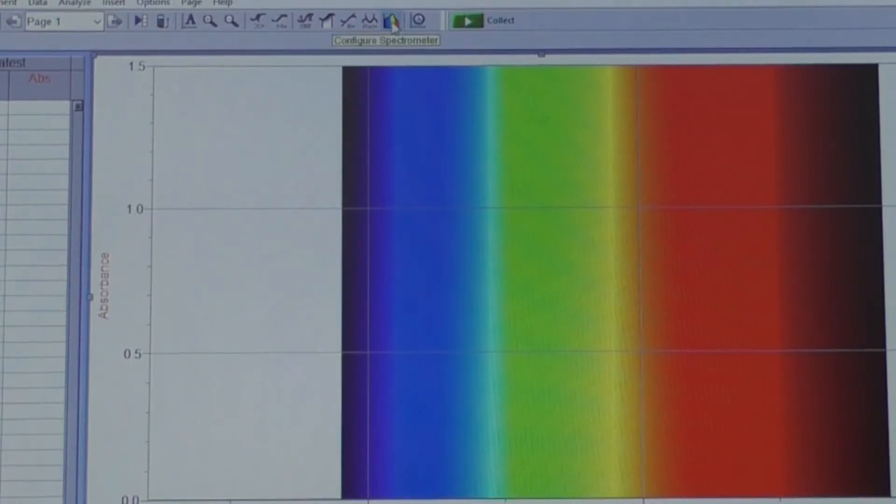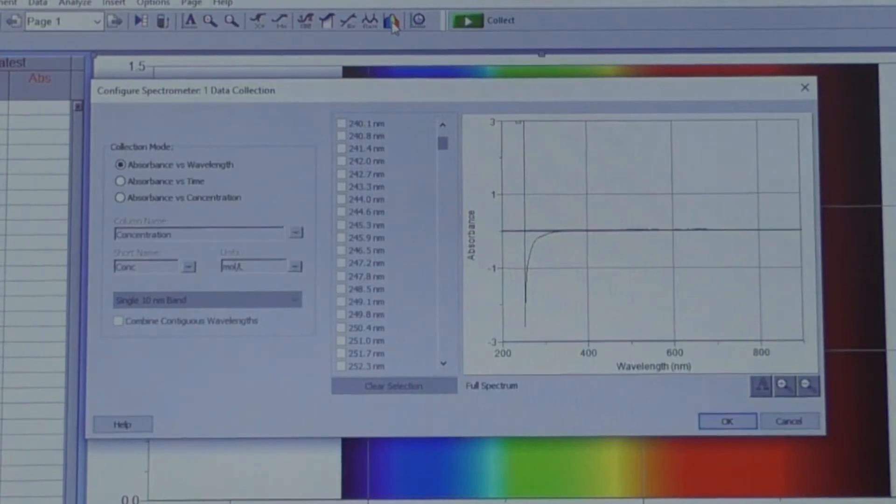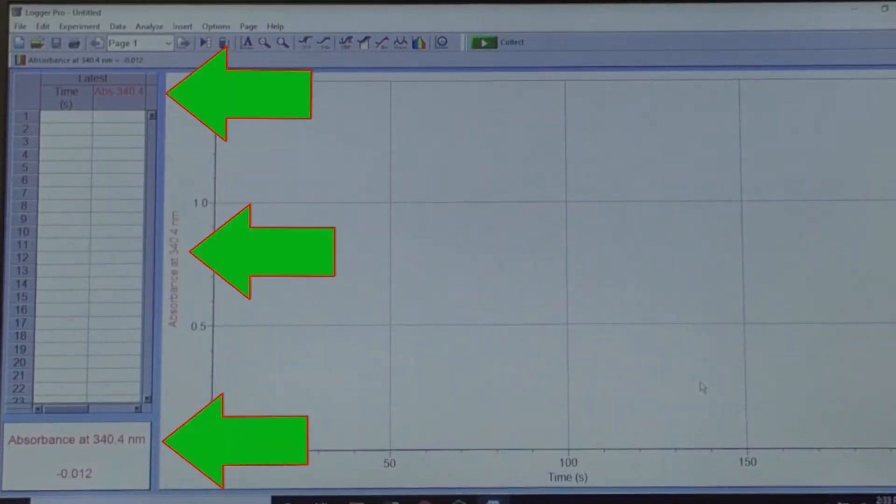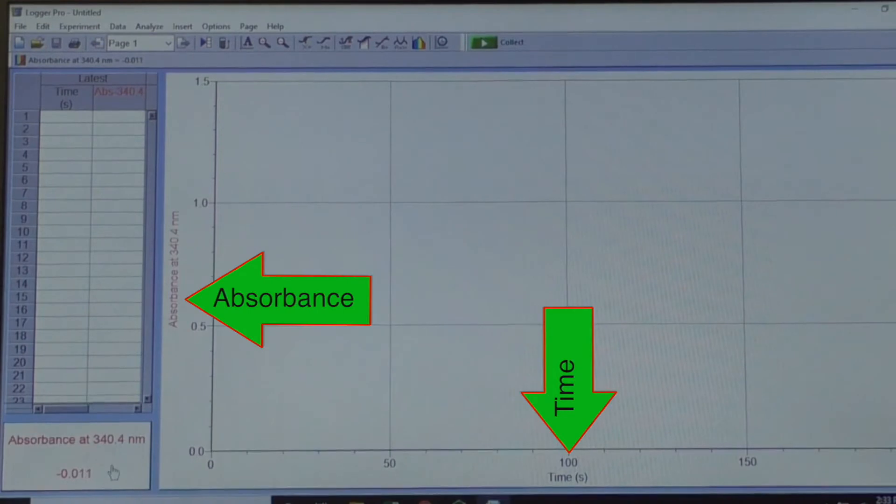To set up Logger Pro to capture absorbance over time, click the rainbow icon in the toolbar at the top. The Configure Spectrometer window will open. Under Collection Mode, select Absorbance versus Time. Next, choose your wavelength, which is 340 nanometers, or whatever number is closest to that, in the scroll down area. Click OK. You should now see the wavelength listed in these three spots. Notice that the rainbow background has disappeared and your axes are now absorbance and time.